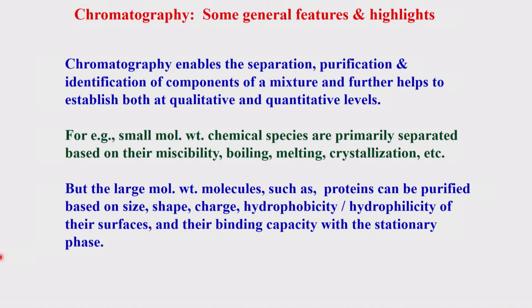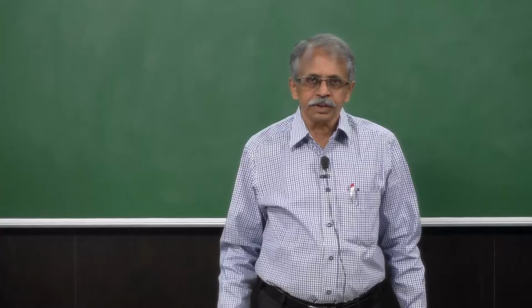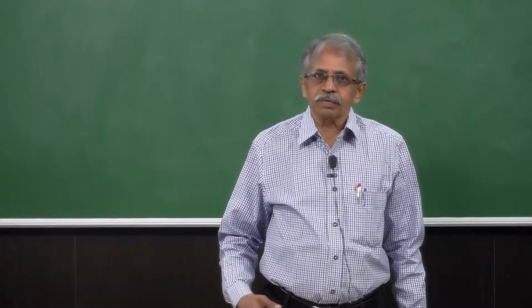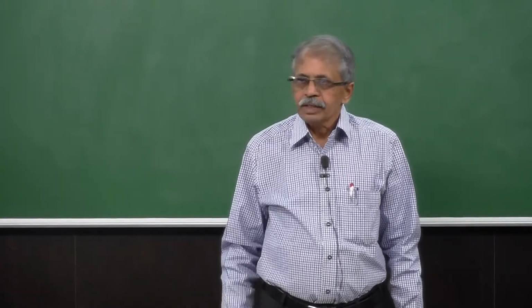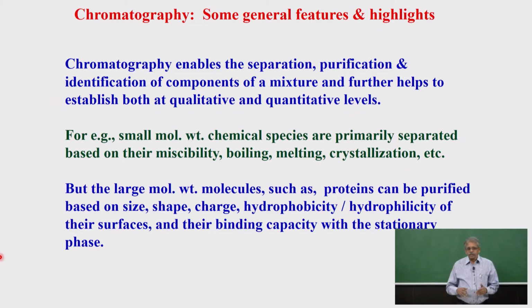Separation techniques obviously are the ones which you can use either with small molecules, like in the chemistry lab, and in the biochemistry lab, where you work with the large molecular weight things, proteins, nucleic acids, and other things. So we look at general features of many of these things in terms of their purification and separation, both put together. Many of these chromatography techniques are connected with detection, and are further connected with identification. Okay, so when you say separation and purification, it also goes without saying that the identification of those compounds is included as well.